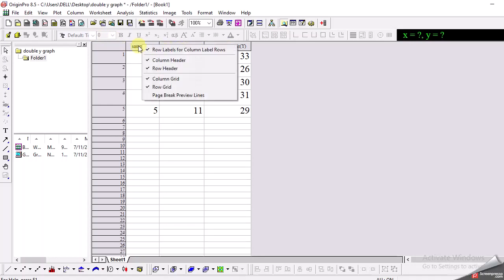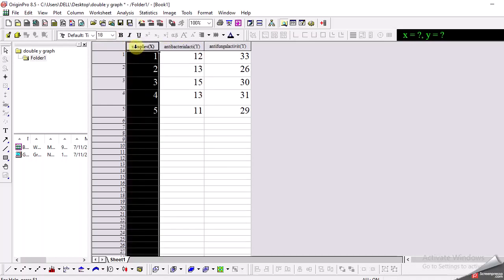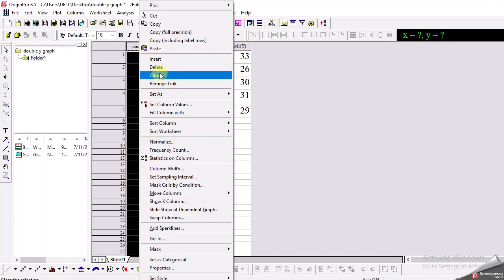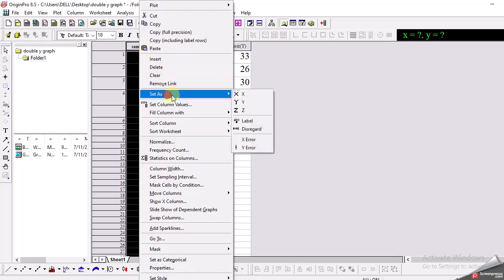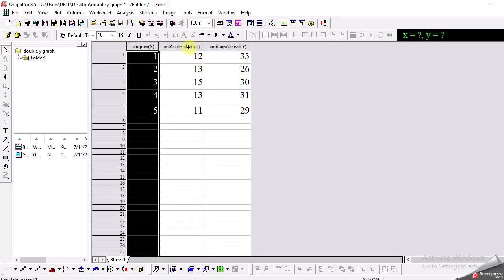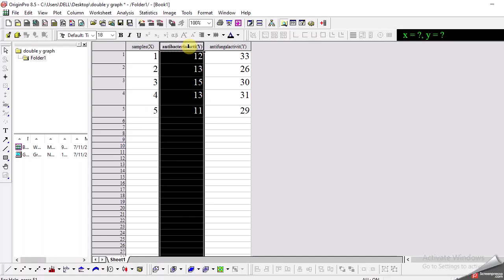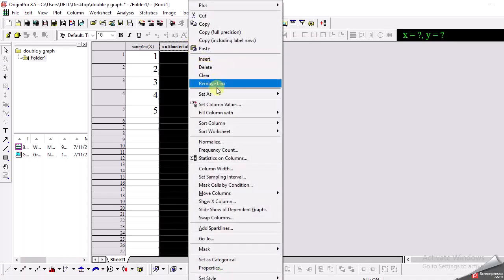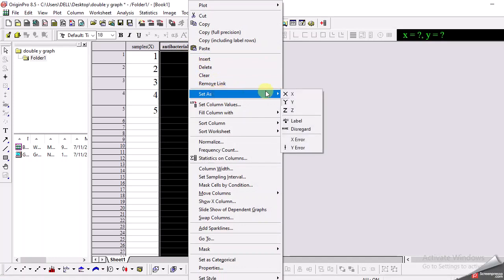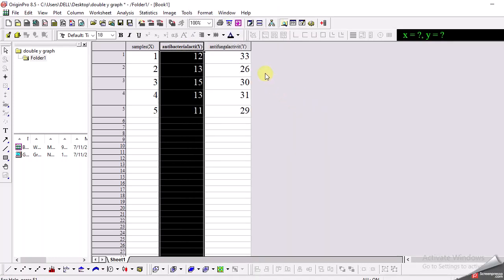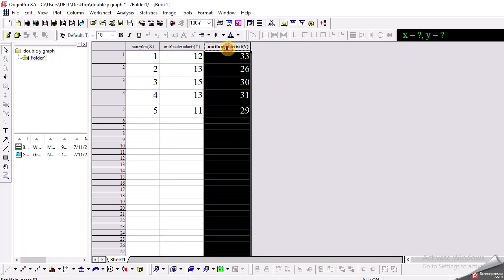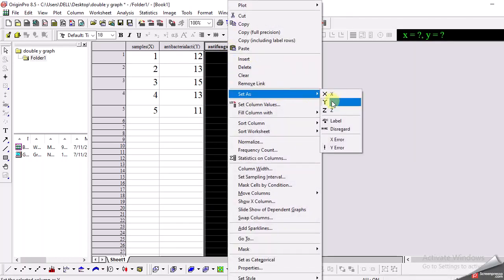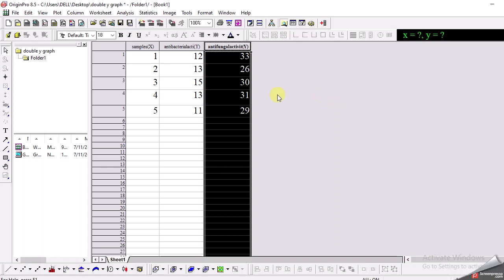For example this one which is the x-axis has to be set as x-axis and the second column is the y-axis. So I need to right click it and set as the y-axis. Similarly the third column is also a y-axis so I will right click it and set as the y-axis. So I have one x-axis and two y-axes in this graph.